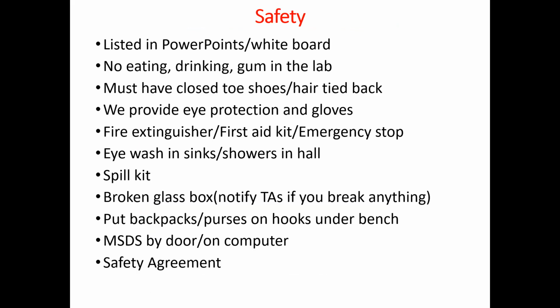For safety in the lab, the safety points will be listed in the PowerPoints and on the whiteboard. There is no eating, drinking, or chewing gum in the lab. You must wear closed-toed shoes and have your hair tied back if it's long. We provide eye protection in the drawers in front of you, and also gloves in 5 sizes.